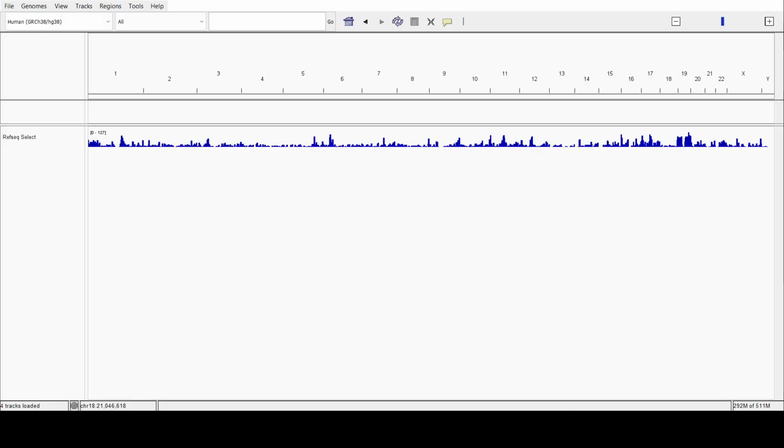So today we are going to do something incredible. We are going to visually look at the DNA sequences we just aligned. We are going to hunt for a mutation with our own eyes using an industry standard desktop application called IGV, the Integrative Genomics Viewer built by the Broad Institute. Okay, so let's step out of the terminal. We will open up IGV, as you can see here, and see what our data actually looks like.